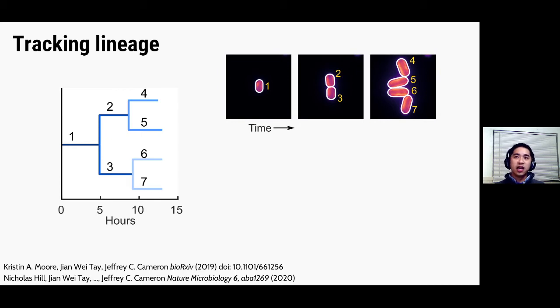Now, if you remember, the tracking code assigns an ID to each cell, as well as keeping track of the mother daughter relationships. So with that information, we can basically generate a tree plot like this, which shows the lineage of a cell. So this example here is of this colony here, which shows the first two divisions in the colony. And the horizontal lines in the lineage tree here indicate the length of time that a cell exists before it divides. And each of these splits here indicates a division event. Now, this type of tree is also known as a binary tree in computer science. And there are actually a lot of algorithms out there to traverse and search for data using these trees. So I've implemented some of the traversal algorithms, so we can basically pull out data belonging to a single colony.